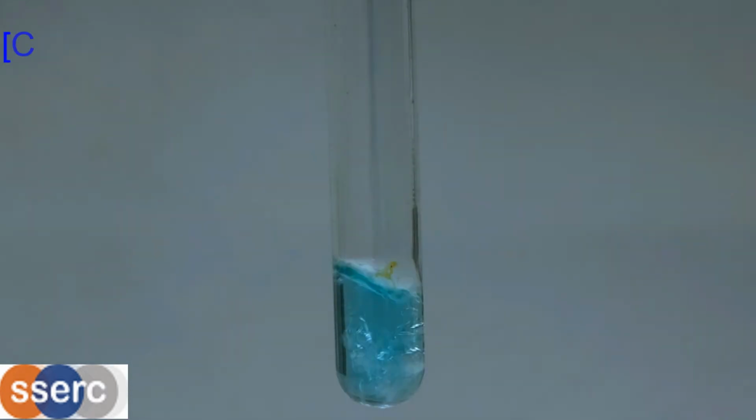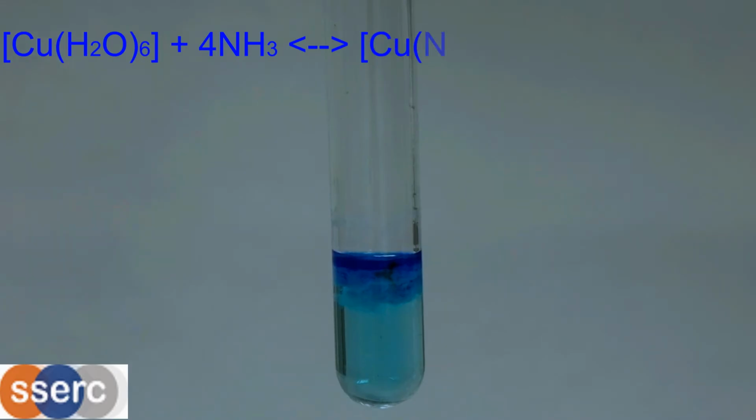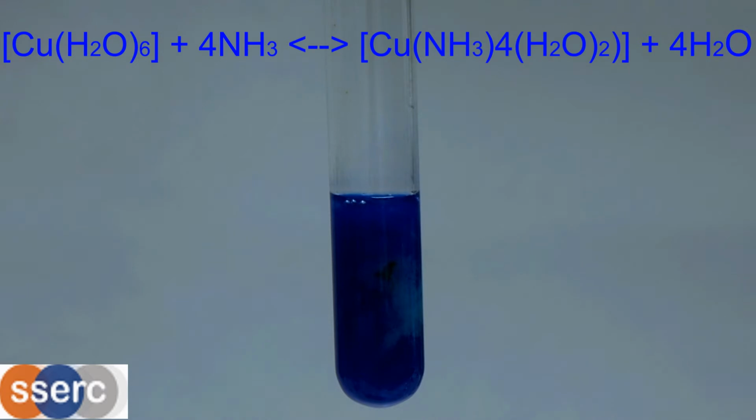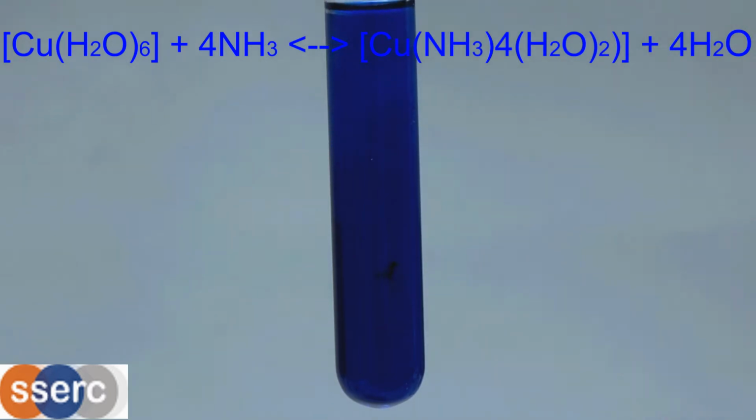A few drops of ammonium hydroxide has the same effect. Copper 2 hydroxide is produced. But this time, on adding excess, the precipitate dissolves, producing a deep blue solution. The colour of copper solutions is due to the copper ion forming a complex with water molecules, which is pale blue. Ammonia can displace the water and produce an amino copper complex, which is dark blue.